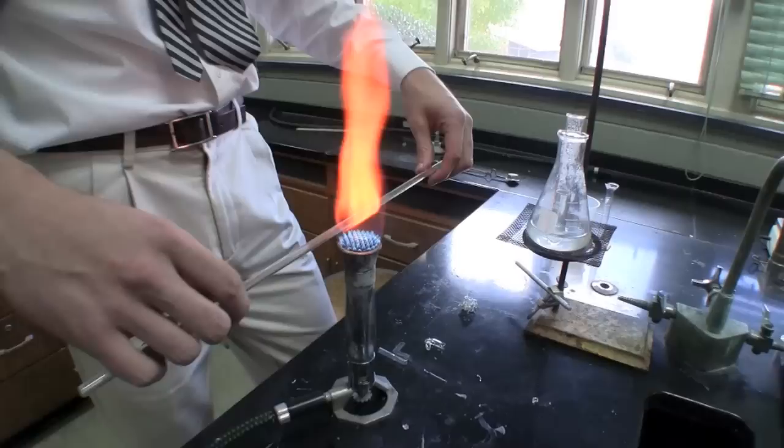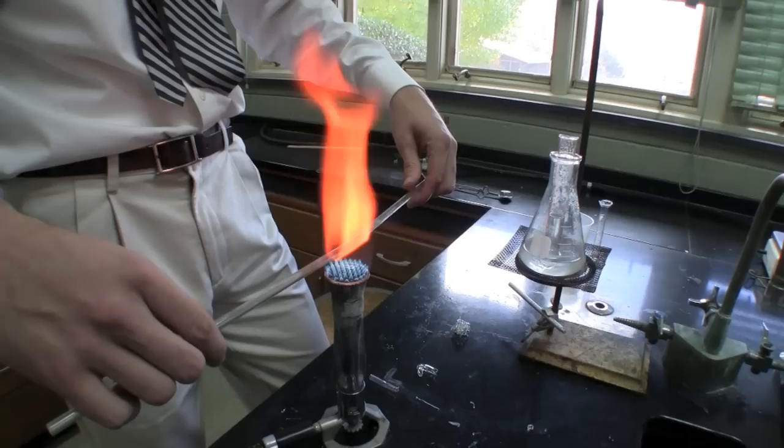Triple XL. Just wait until it gets nice and free flowing. You can see it's starting to get a little bend to it.